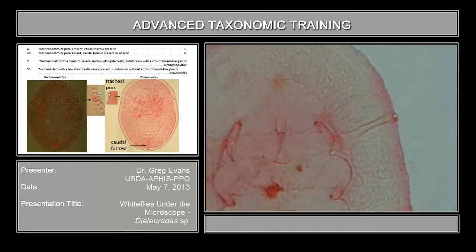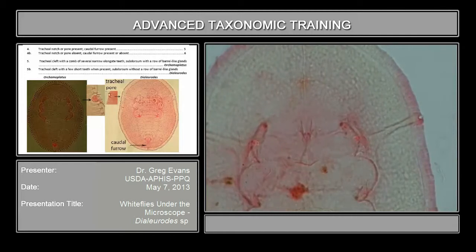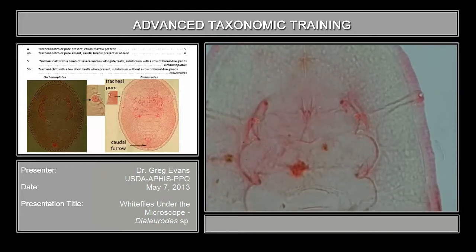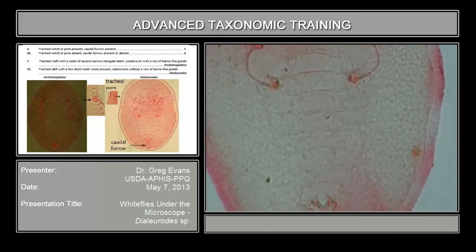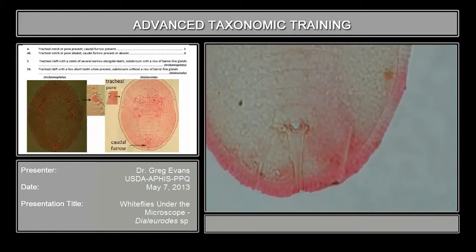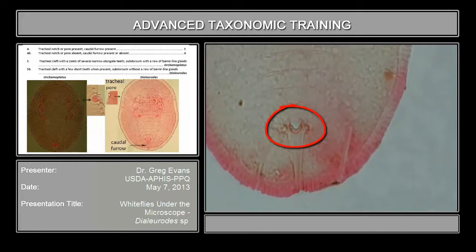Dialerodes also has this very faint halo above the mouthparts, and if you go down to the vasiformorphous you see it's somewhat hemispherical, semi-hemispherical, very small, and the operculum covers nearly the entire orifice.